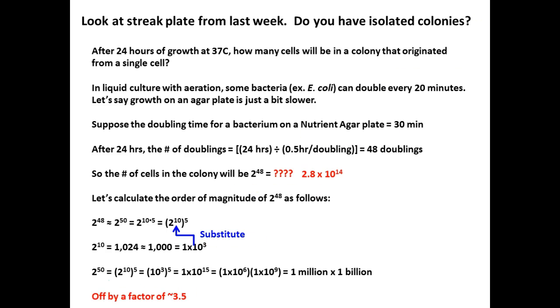So there have been studies, and we have reference to one in here. As we were saying a moment ago, it's going to be different in a broth culture as opposed to when we grow them on the Petri dish, on the agar, especially if they're non-motile. In that environment, it's not going to be easy to swim. Some of them wiggle along the surface, but they're going to be confined by the constraints of that type of environment, especially when it comes to availability of oxygen, if they're piled up on each other and nutrients become less available.